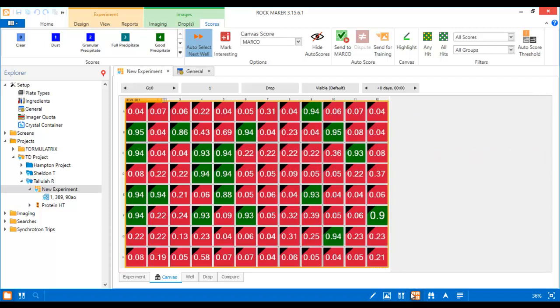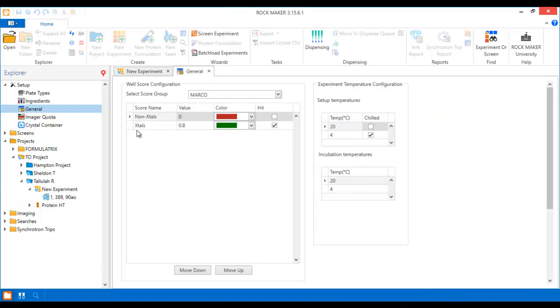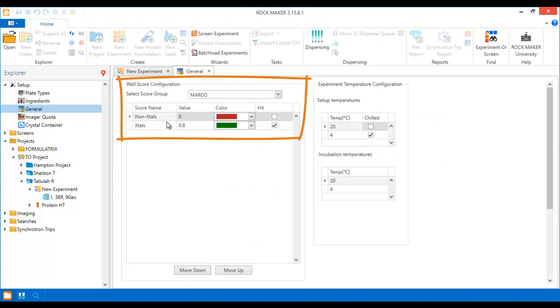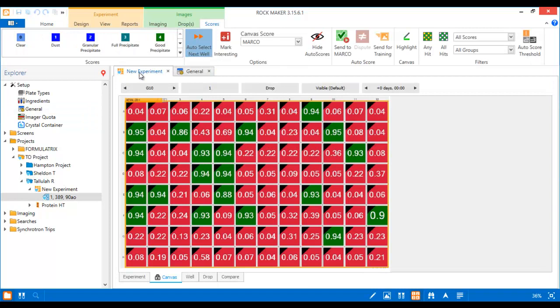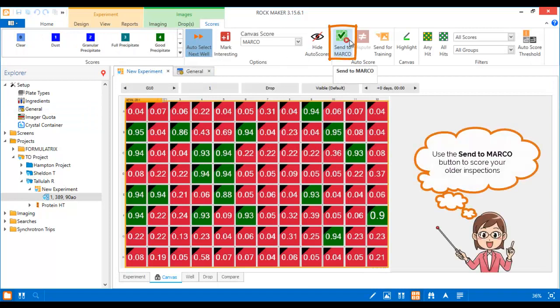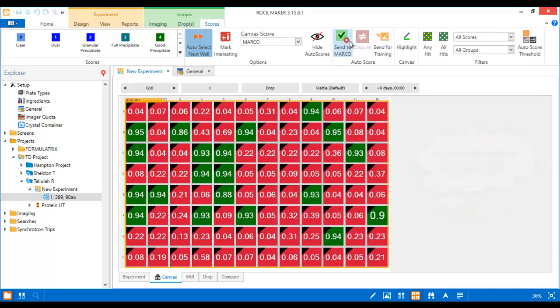Those score colors and values can be customized in the WellScore configuration panel so that Marco can work with you just as you like. Marco will always score any new images automatically without you telling it to do so. There's also a Send to Marco button on the Scores tab, which you can use to score your older inspections that you collected prior to enabling Marco in Rockmaker.